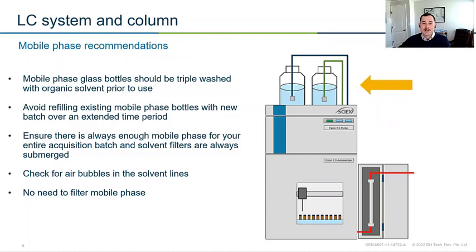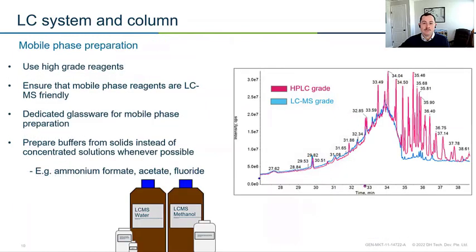So another thing we can check out is our mobile phases themselves. This is actually from some data from a project that a colleague and I are working on. The group is looking at solvent purity, and they're doing some semiconductor analysis. Essentially they need the solvents to be as pure as possible. So they asked us to dry down a few solvents and see what impurities we could find.